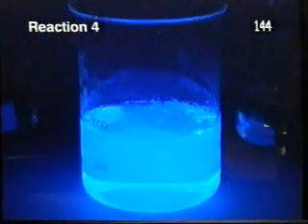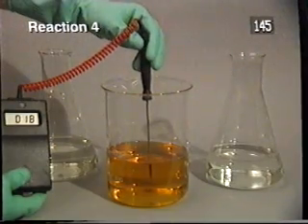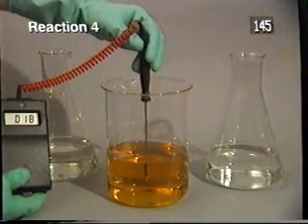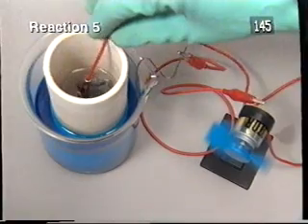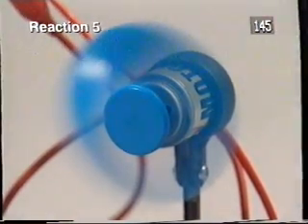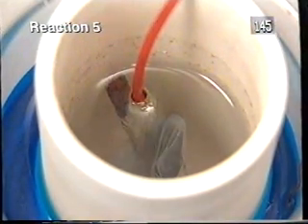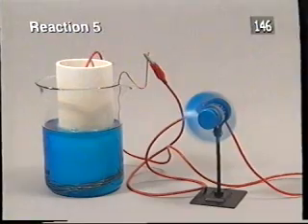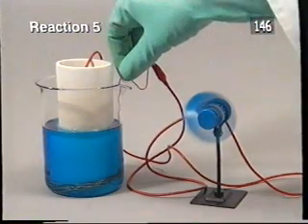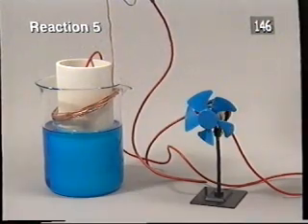Energy was given out in this reaction as light. However, little heat was generated. The temperature of the solutions was the same. This reaction generated electricity. The reaction gives off a gas. When the coil was removed from the solution, the reaction stops, and so does the fan.